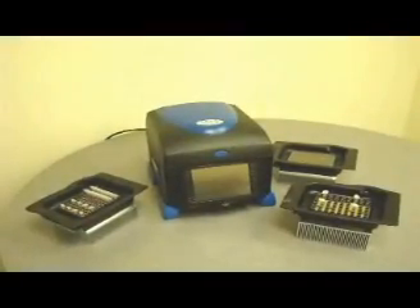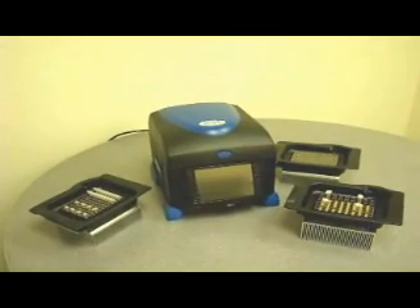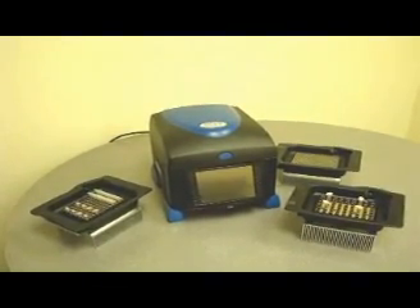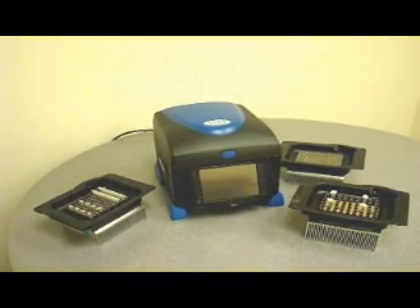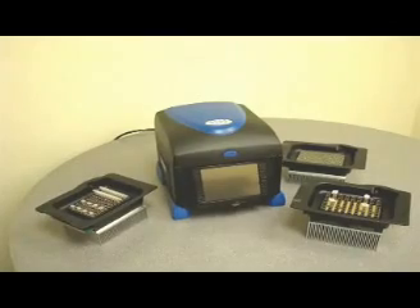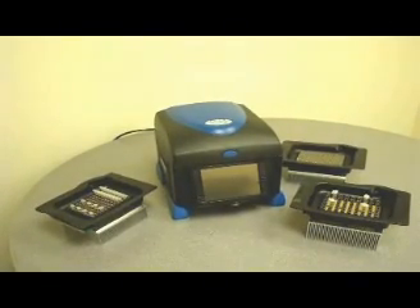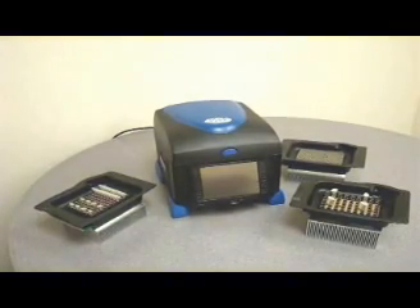The advanced Amplitronics A6 machine features a 36-degree range of gradient programming — the widest range available on the market today — and the flexibility to use four different blocks to accommodate different reaction vessels. Plus, it has expanded programming and programming storage over the A4 unit.